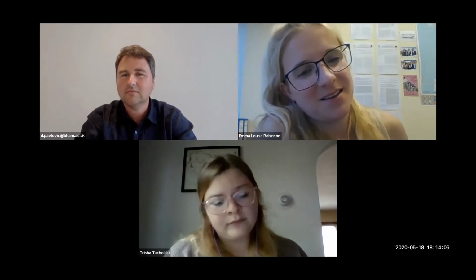Yeah, absolutely. Thank you. Next question, another question from Danuta. She asks, one more, if I may. Do you see MLC2V deamidation at asparagine N converting to aspartic acid at position 14, which is next to the phosphorylation site at serine 15?